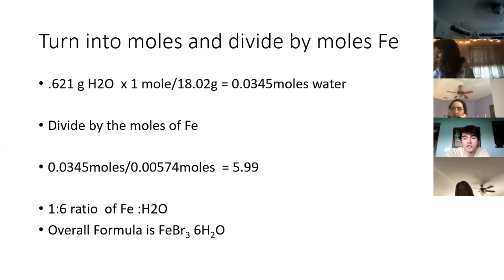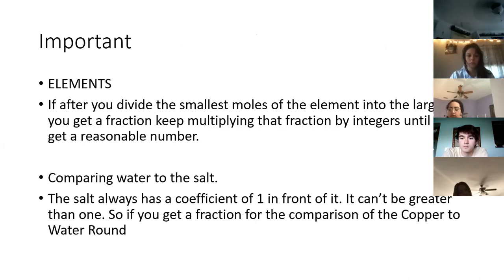I've got a quick question about rounding. When we get the final mole ratio, is it just normal rounding? Like if it's above 0.5, then you round up, and if it's less, you round down? Excellent question, Kyle, and it depends. It depends upon what you're looking at.